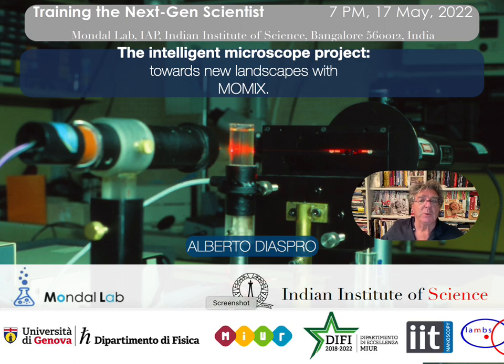Today, I would like to discuss with you the Intelligent Microscope Project. This means trying to find new landscapes with a project that we call MOMIX, and I'll try to convince you of its relevance.